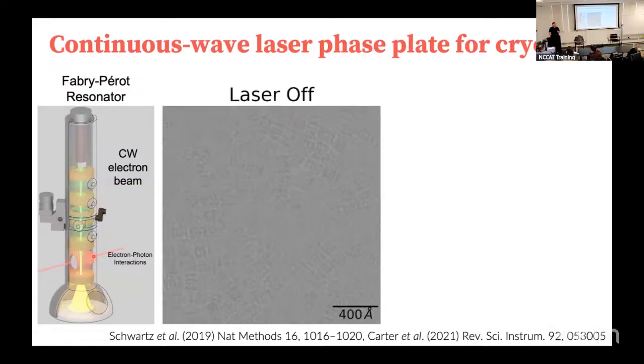And so the results of this are very dramatic. This, as you probably all know, is pretty standard for a cryo-EM single particle image. You can see here very weak, low contrast images of the 20S proteasome. You can see this little trash can type complex in the images, and there are many of them. This is just standard; if you were to go downstairs and use the Krios, that's what it would look like.